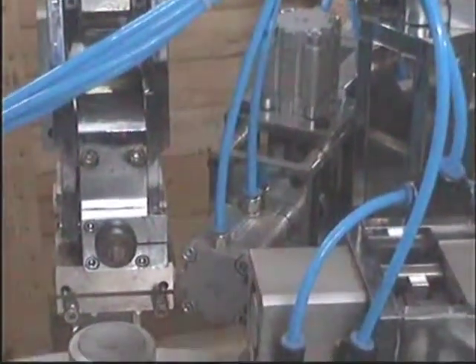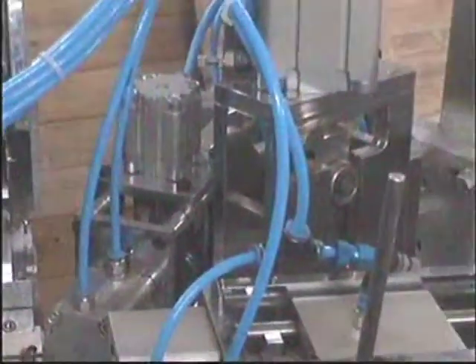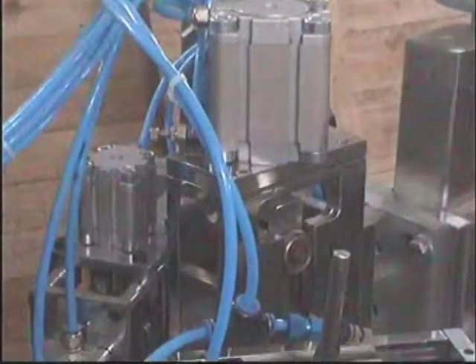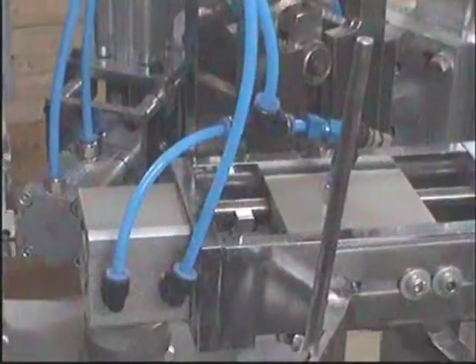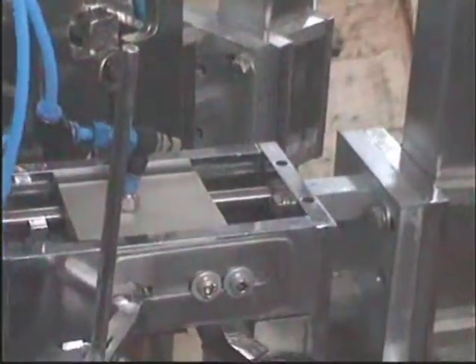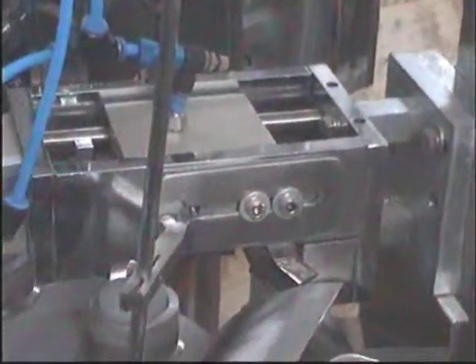On one side and one at the rear side, which ensures the second fold. Immediately after the second fold you are seeing this cylinder which is for mechanical batch coding system given in the machine. Next to the batch coding system, for aluminum, this is the tool for cutting the lamy tube.